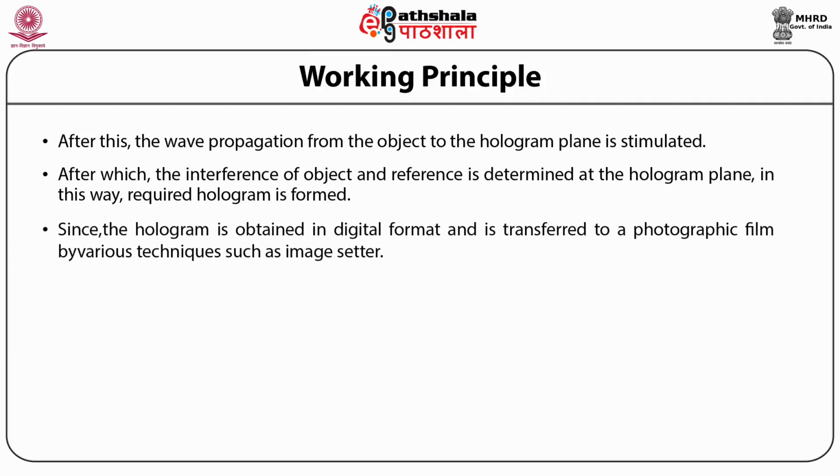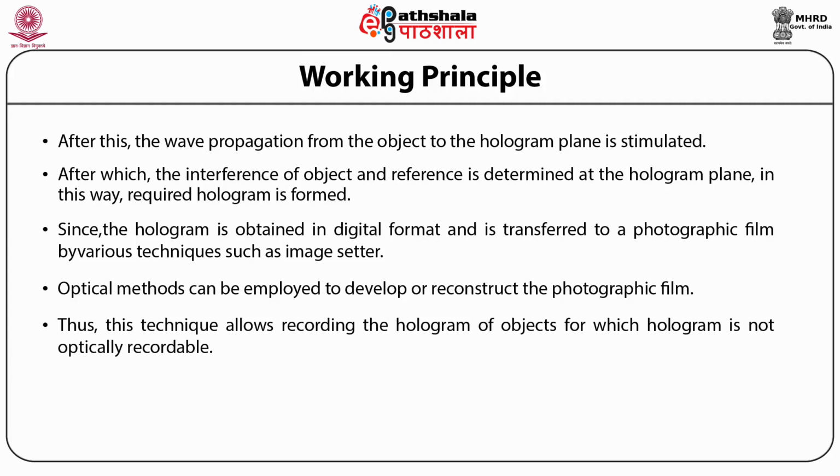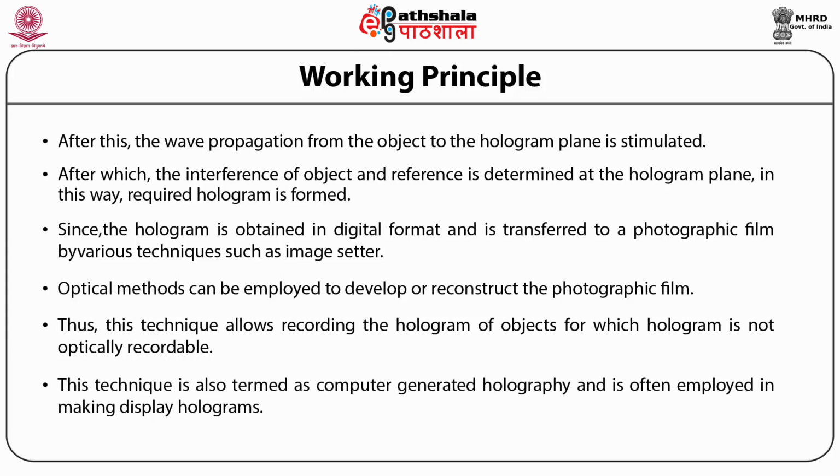Since the hologram is obtained in digital format, it is transferred to a photographic film by various techniques such as an image setter, and optical methods can be employed to develop or reconstruct the photographic film. Thus, this technique allows recording the hologram of objects for which a hologram is not optically recordable. This technique is also termed computer-generated holography and is often employed in making display holograms.